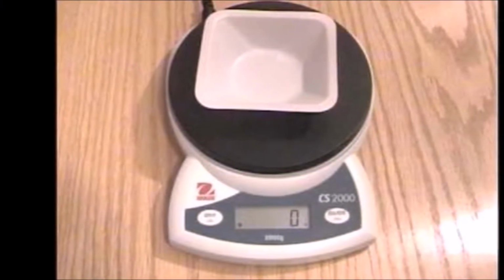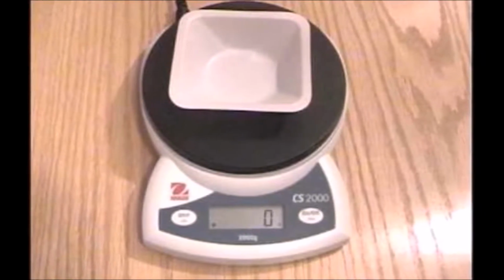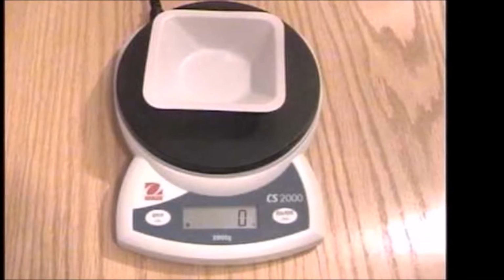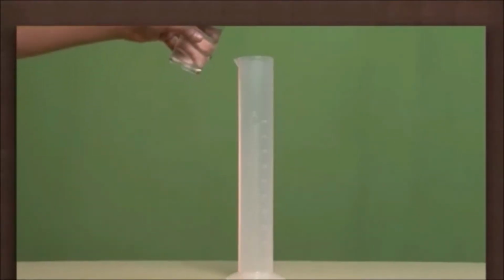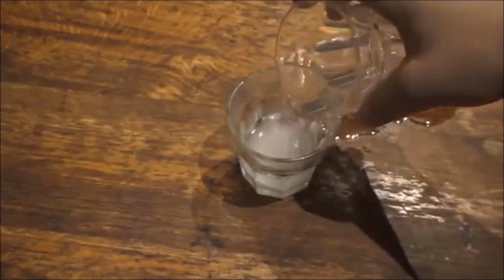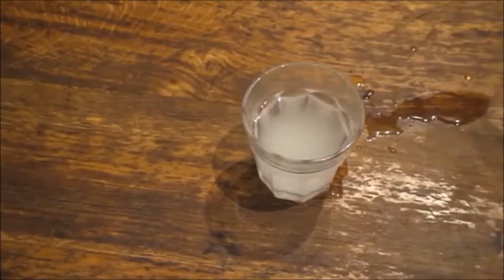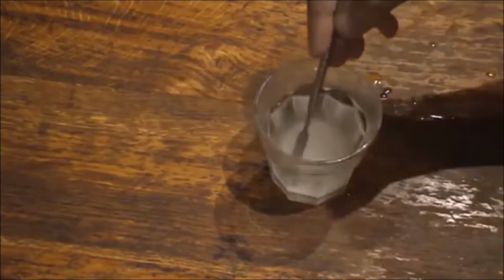Using a spatula, drop 1 gram of sodium bicarbonate inside a weighboat. Place the weighboat on top of a weighing machine, adding and removing sodium bicarbonate as needed, so exactly 1 gram is present. Using a graduated cylinder, measure exactly 100 ml of distilled water. Add the 100 ml of distilled water in the 200 ml beaker labeled 1 gram of sodium bicarbonate. Then, add the 1 gram of sodium bicarbonate inside the beaker. Stir the bicarbonate in the water until fully dissolved.